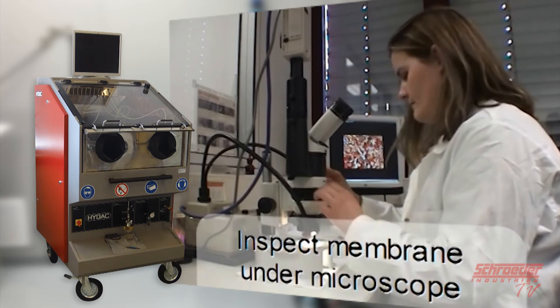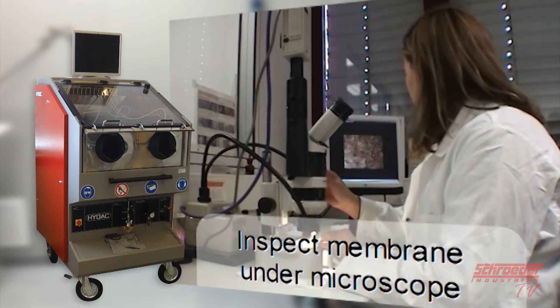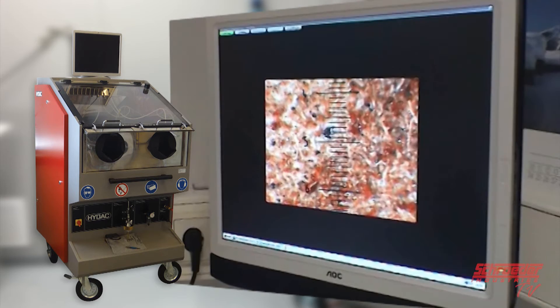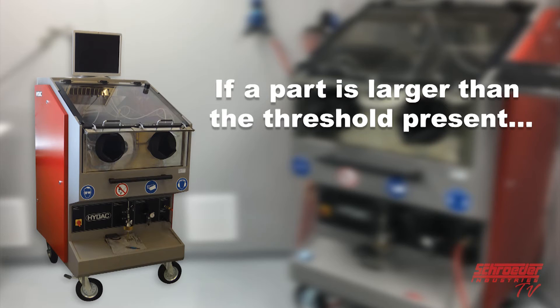Inspect the membrane under a microscope for size of particulates in the patch. The threshold is dependent upon industry application. For example, approximately 100 microns for automotive fuel injection systems and up to approximately 600 microns for motors and air conditioning. If a particulate is larger than the threshold present, that means the part tested failed to meet the cleanliness requirements.